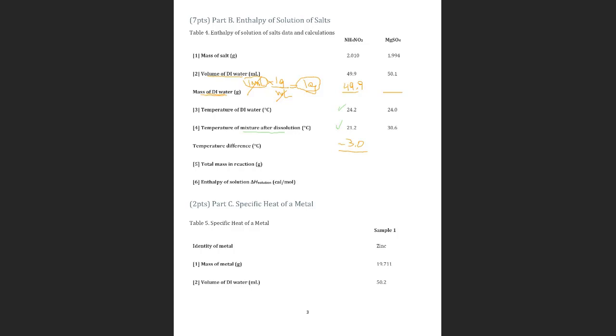Total mass in the reaction. Total mass is the mass of the salt plus the mass of the water. Yes. So let's see. Yes, 51.91. Awesome. And the last part, it says enthalpy of solution in calories per mole.